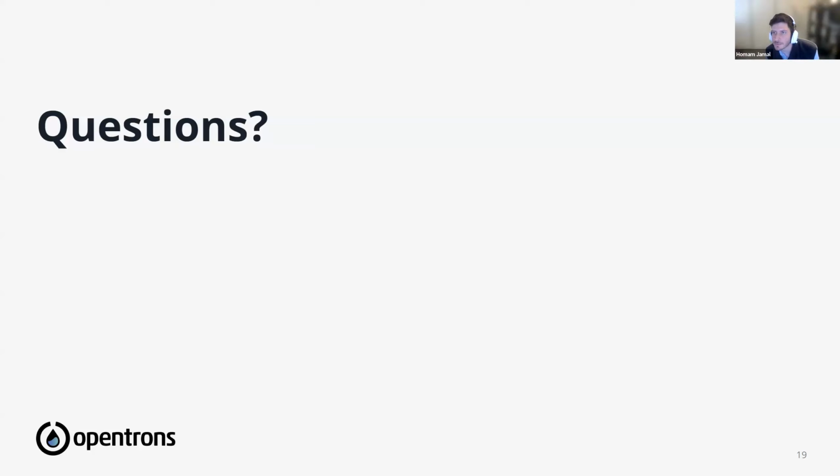Yeah, so I'll answer the second question first. The protocol is in Python, and this is the preferred method when it comes to using AI to generate these protocols. We do have a way that produces JSON files, but at that point, you're using our easy-to-use graphic user interface to produce this JSON file, and we don't have a good way to convert the JSON file to a Python file. So yes, Python is what we're using.